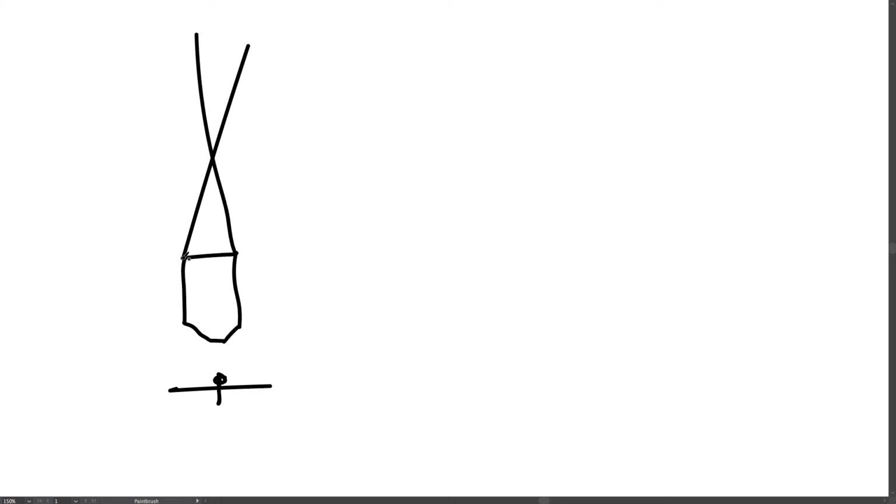That is, it focuses this light to a point, and then this light ray ends up over here, and this light ray ends up over here, and for instance, this light ray would end over here, and this light ray would end here, and the one right down the middle would end here, and then you have the eyepiece, which also has a lens in it, and it would bring the information to crossover as well.